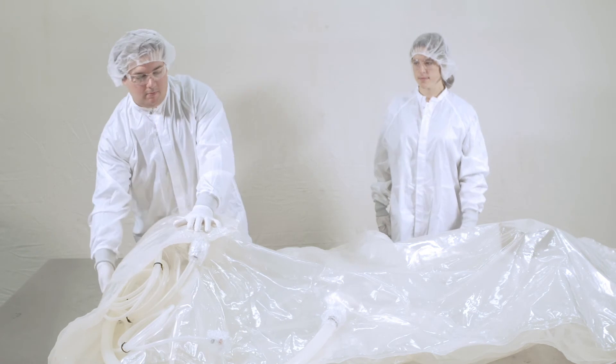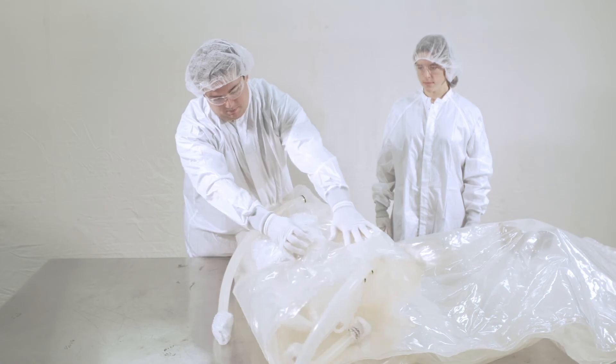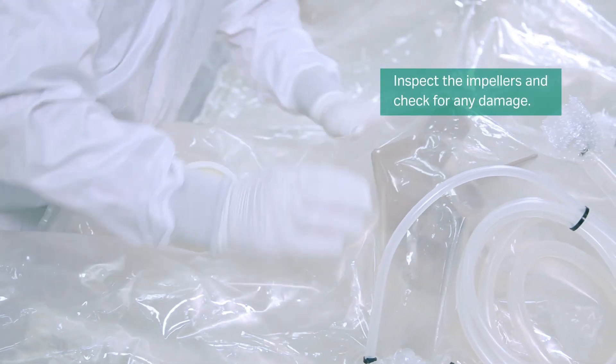Carefully fold the bag over and remove the bubble wrap and foam from each impeller baseplate. Inspect the impellers and check blades for any damage.